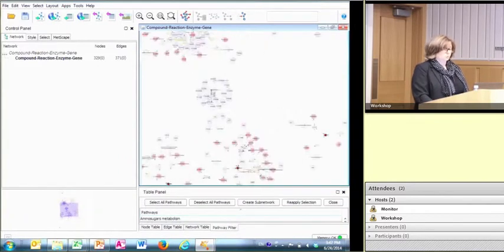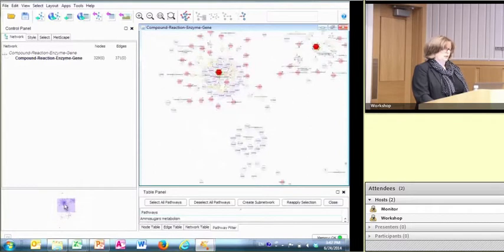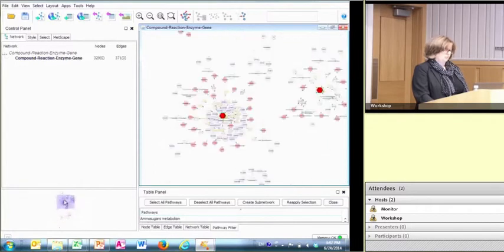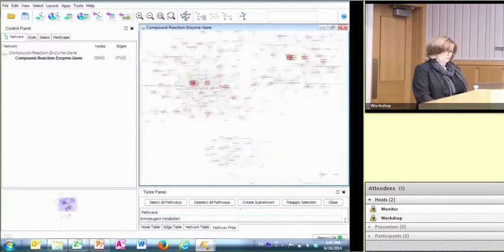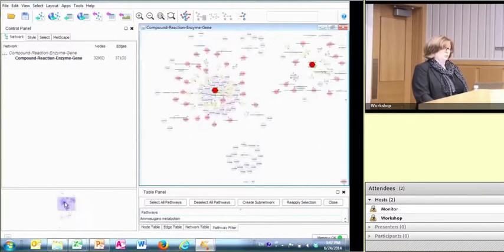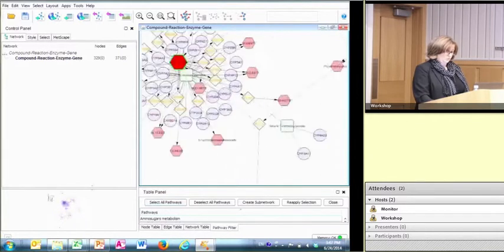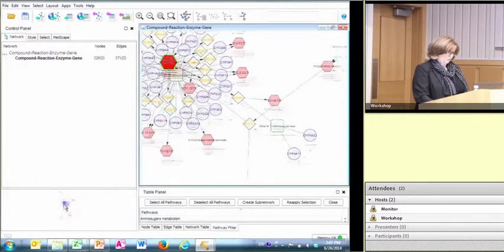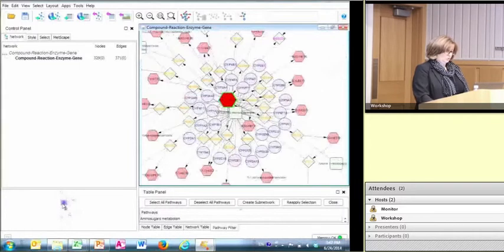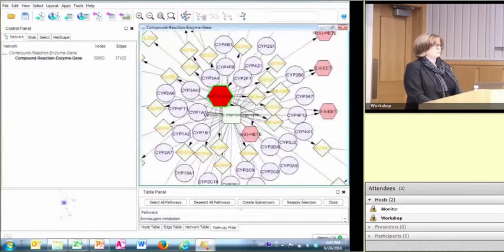You, of course, want to zoom in, right? So now I am zoomed in, and some of those things kind of went outside my screen. There are a couple of different ways to do that. In this case, one way to navigate your network screen is to move this rectangle here, which hopefully you can see what I'm doing, right? So now I can zoom on one of these clusters, if you will, okay? And so I'm going to put it in the center of my screen, and that's where you can start reading the names and so on and so forth.